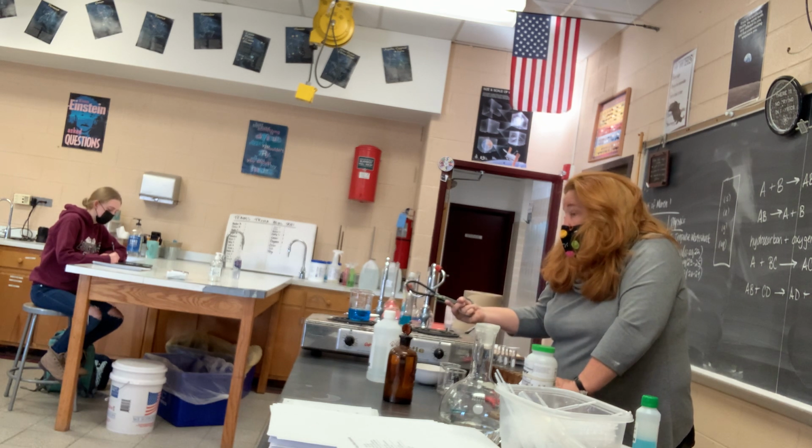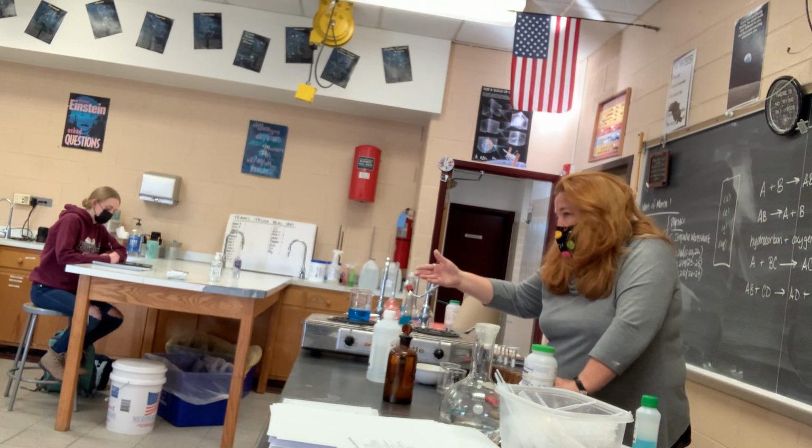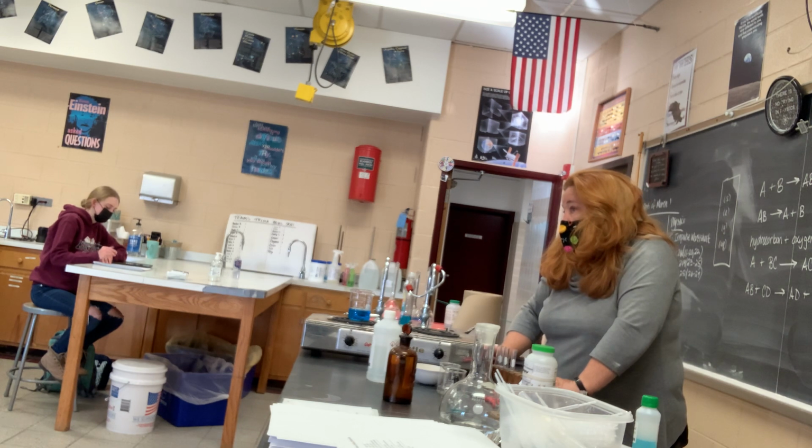And you can tell it's copper in color and everything, but little tiny flakes are starting to form because it's warmer, and over time, more of it will form. You'll get pure copper out of the copper sulfate.